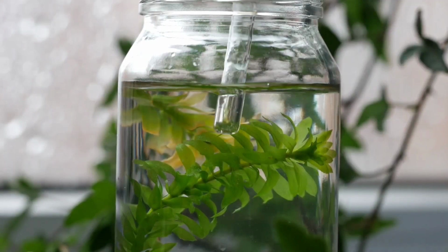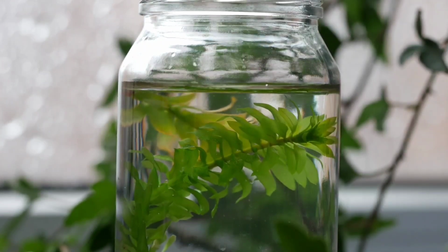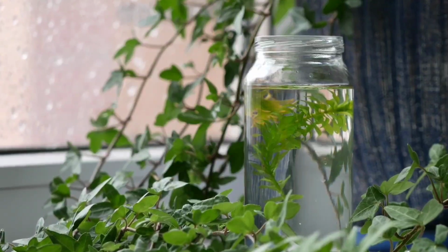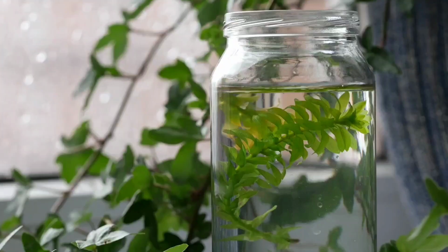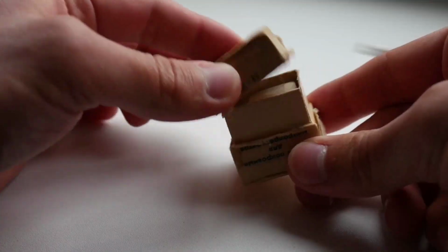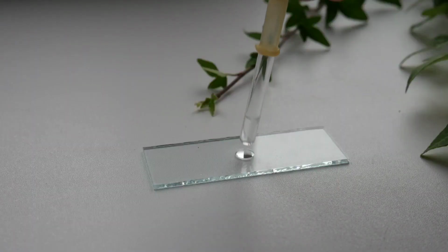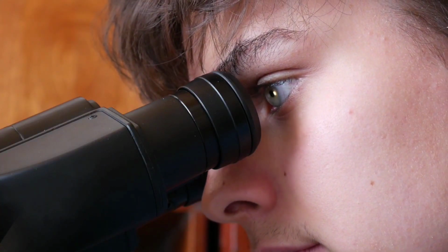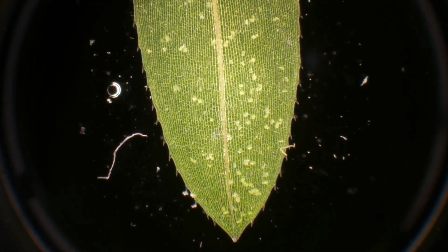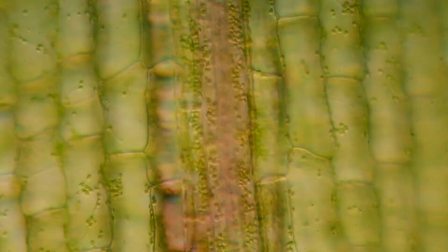So as you understand from the title of the video, today we will look at the microcosm surrounding us through the eyepiece of a microscope, and first in line we will have this small jar of algae. It is not an algae, but a real higher plant, Elodea, an aquatic plant. Take a small piece of its leaf, drop a little water on a glass slide and look at the green tissue of the plant under a microscope. Already at a slight magnification it is clear that life is in full swing inside the Elodea, which of course we will not see with the naked eye.